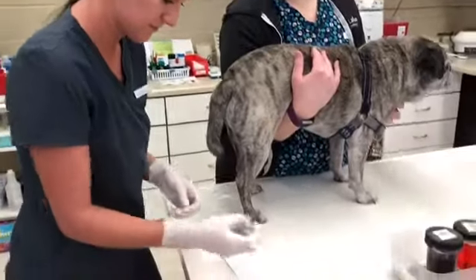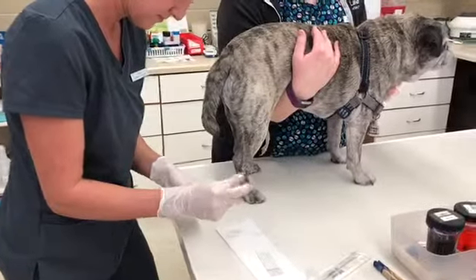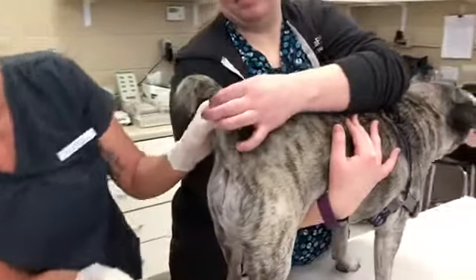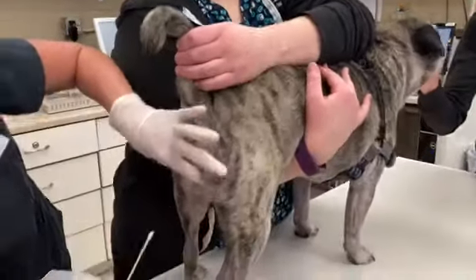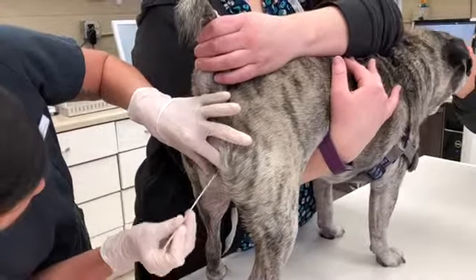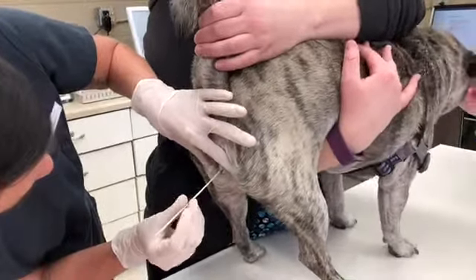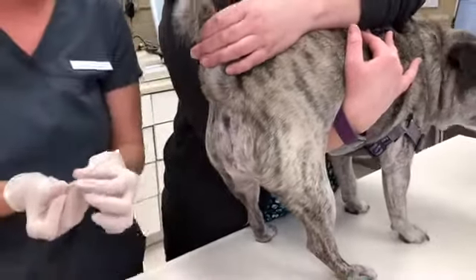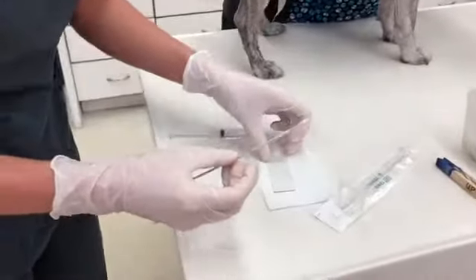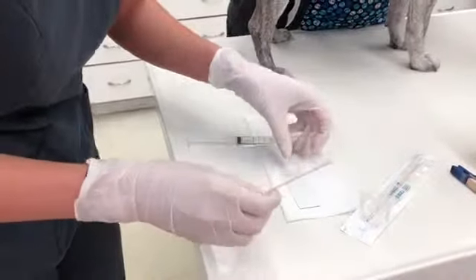I am going to enter the swab into the vaginal vestibule and then just rotate it a few times to get the proper sample. There we go, perfect. Then I'm going to roll it along a clean slide — make sure there's nothing on there — there we go.